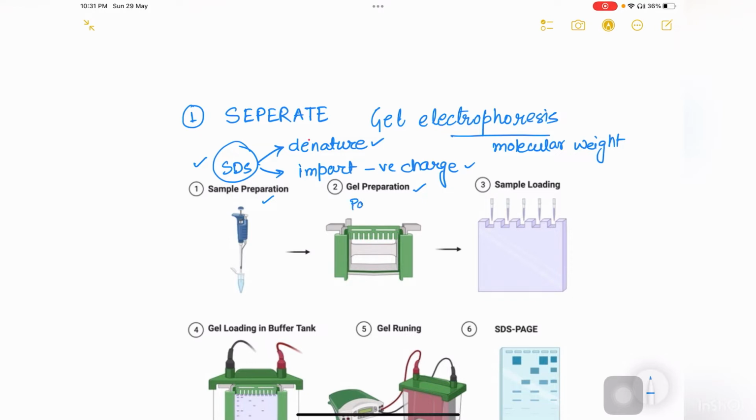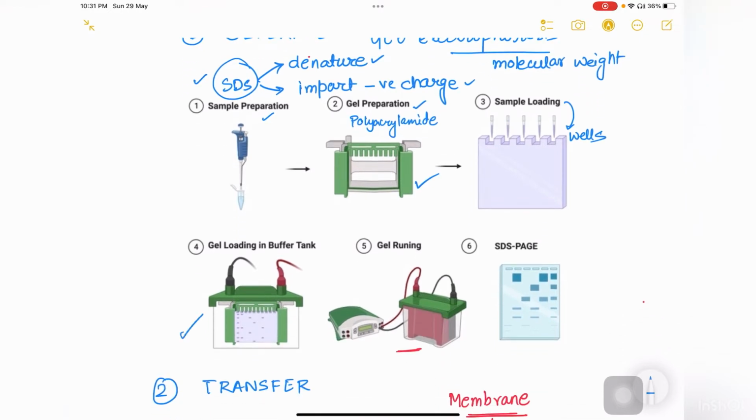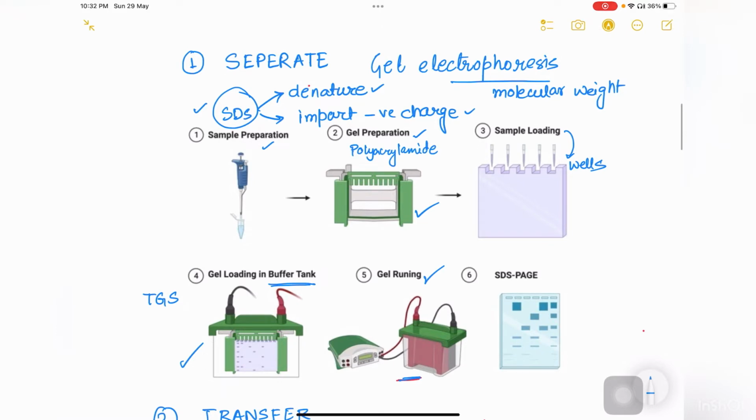So this polyacrylamide gel is prepared. A typical gel cassette looks like this, and then this sample is loaded onto the wells of this gel, and then this gel is placed into this cassette and placed into the buffer tank. The running buffer of SDS-PAGE is TGS. TGS stands for tris glycine and SDS. And then this gel is run in this apparatus by the application of a certain electric current. So this is the process by which we can separate the whole proteins of the cell by their molecular weight.